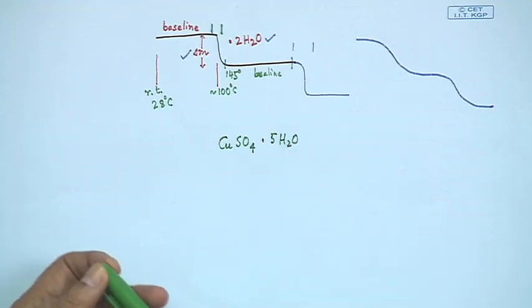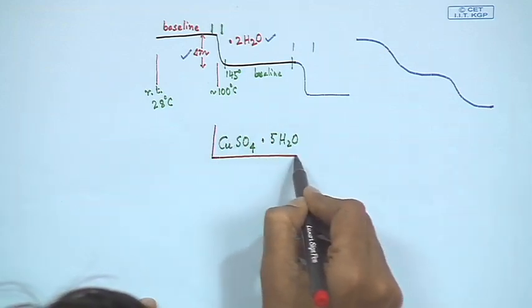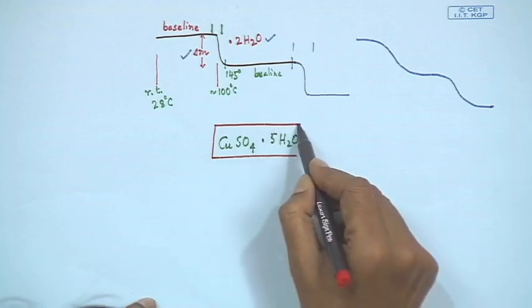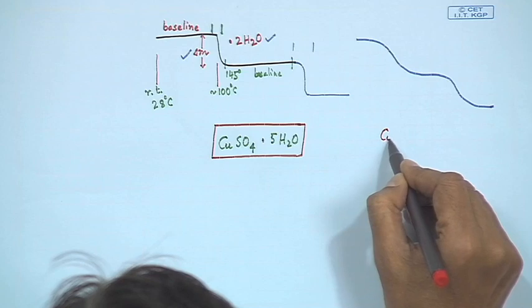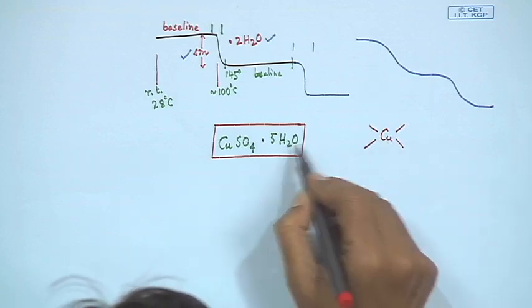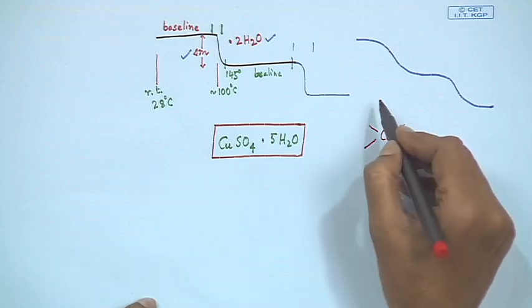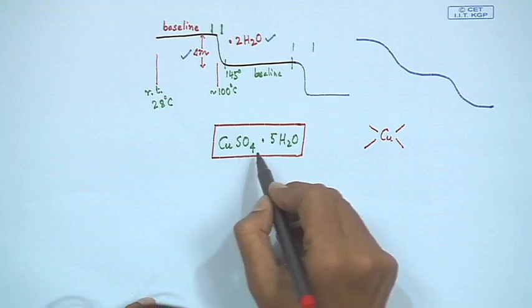So, copper sulfate pentahydrate, we call these. What we find, and we try to see, is the copper environment: whether these water molecules are bound to it, or whether we can have some sulfate bound to it, and how the sulfate is bound.